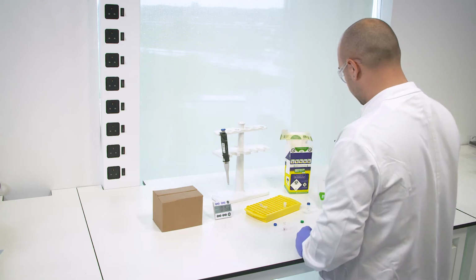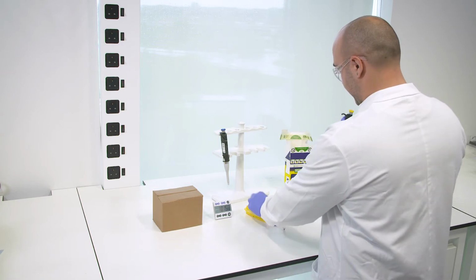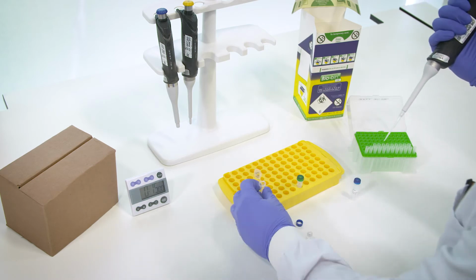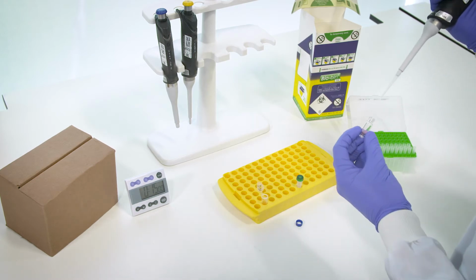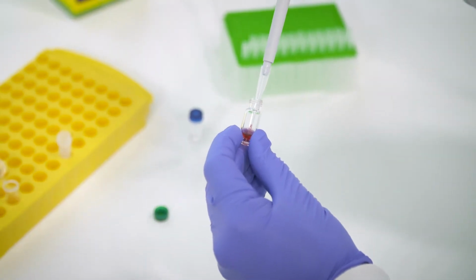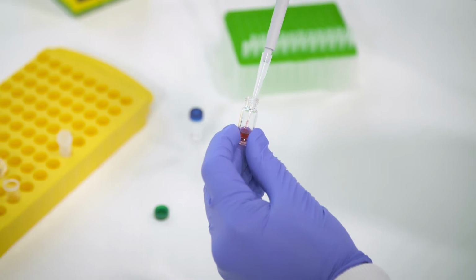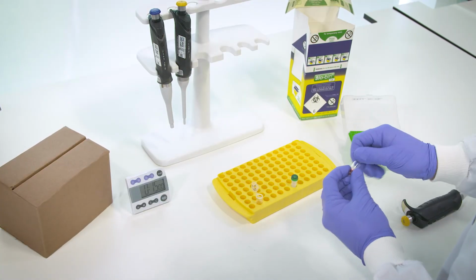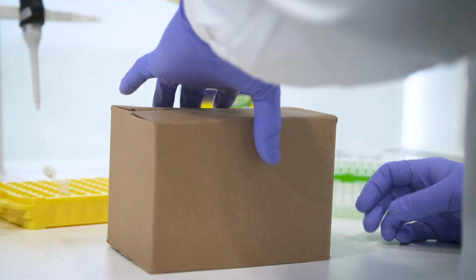Next, pipette the antibody modifier mix into the lyophilized Lightning Link vial. The process only takes about 30 seconds, and that's it! Now leave your antibody to incubate for 15 minutes at room temperature in the dark.